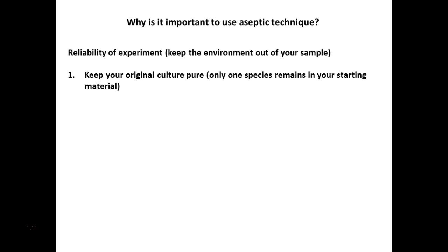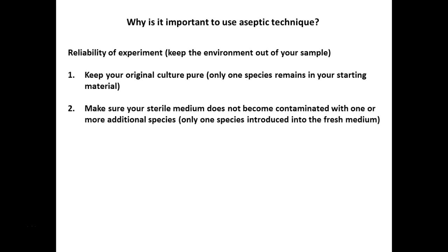Why is it important to be aseptic? We want to make sure that we're testing our organism and not some contaminant, right? So the reliability of the tests, and keep our environment out. So we want to keep that as pure as possible, a single species. Make sure our sterile media doesn't become contaminated, right? So again, we always check our sterile media before we start, make sure that it didn't become contaminated. Because then when we add our organism, right, we'll mess everything up.